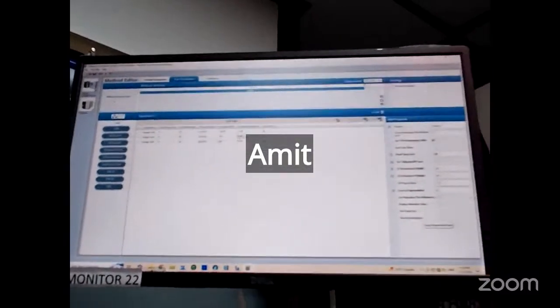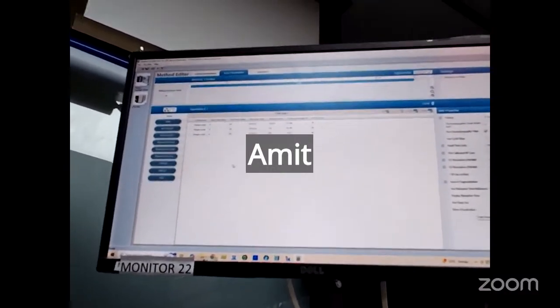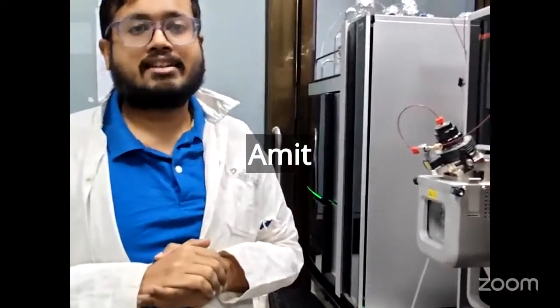Here I am showing you one of the examples. In both configurations, what is generally required is that we give the precursor ion within a defined m/z. The precursor ions are selected either in DDA mode or in DIA mode.